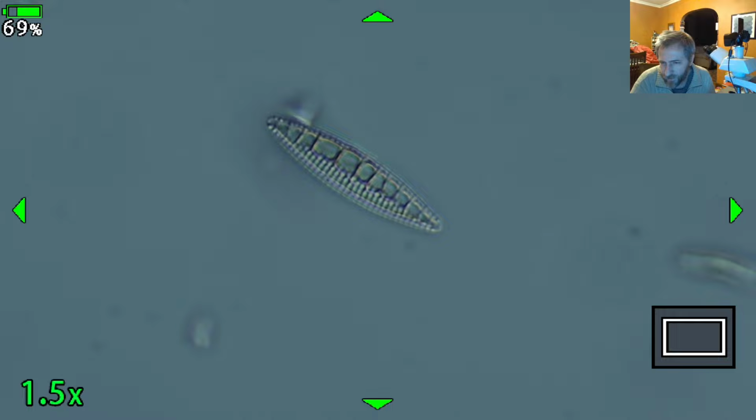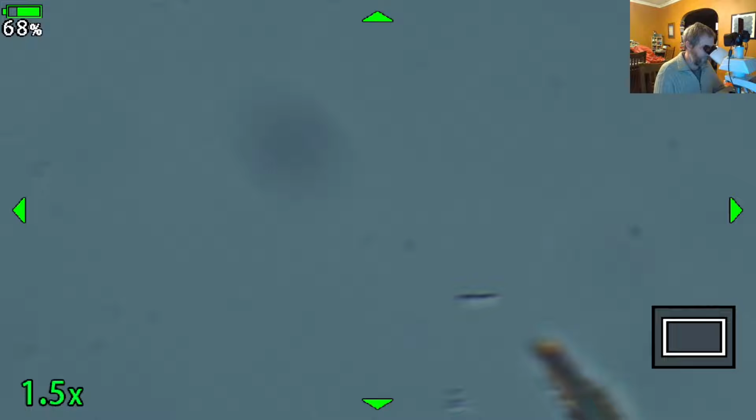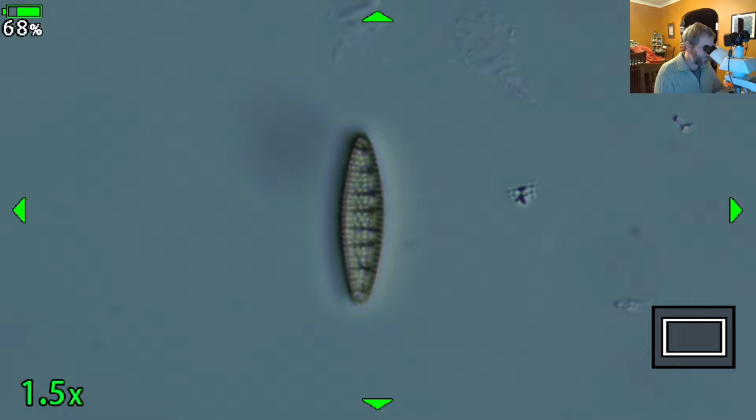Oh, it looks like teeth. Yeah, I suppose it does. They look a little bit like teeth. Denticula, the name Denticula means like teeth. And I think that's where people would have stuck this in, or they fought with where it belonged and then ultimately just decided to move it off into its own genus. You can see there's a bunch of those. Grunowia, here's another one. And there's another coccineus. Oops, I guess you can see it.